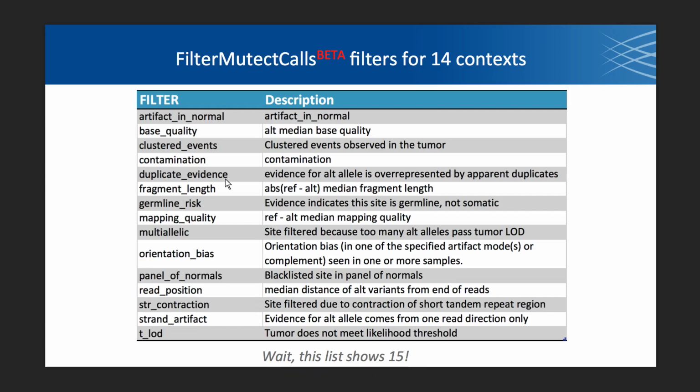And these errors could be real because polymerase slippage doesn't just happen in a PCR reaction, it happens in our cells. But they could also be errors, and we have filters on 1 to 2 repeats that are lost. If a variant is detected only on one strand of DNA, this is a laboratory error, and we filter for that.